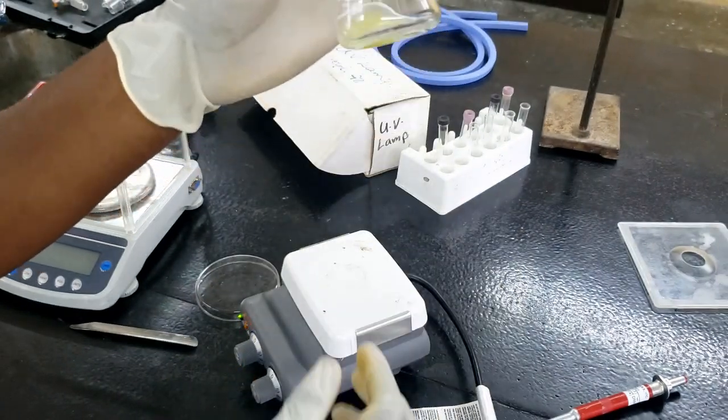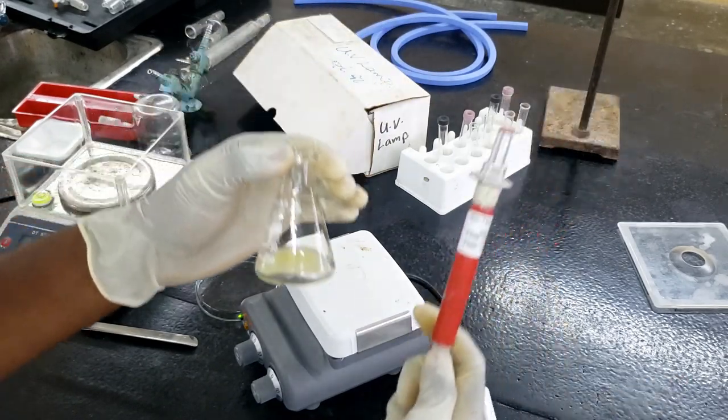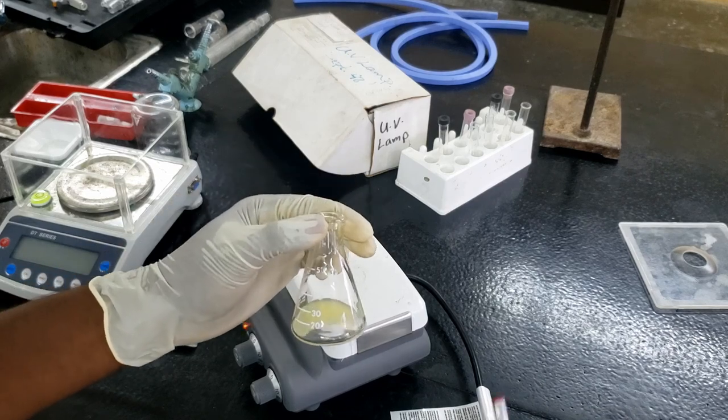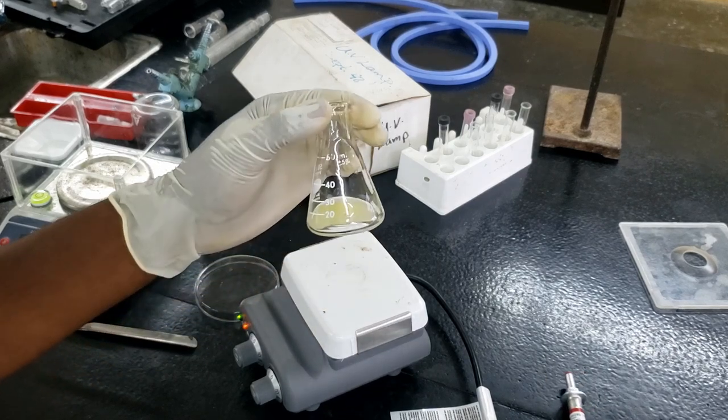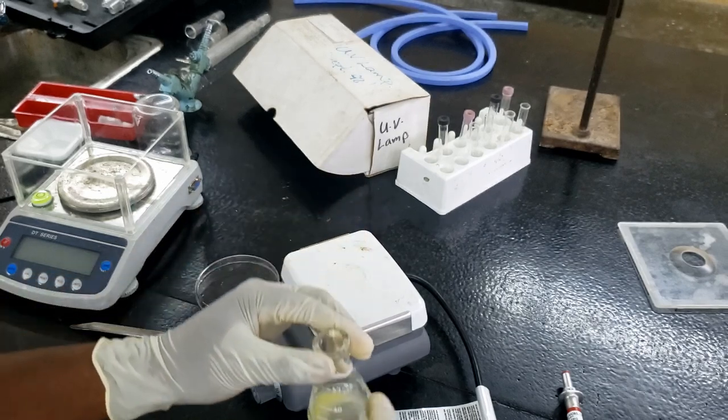So what I'll do now, I'll leave this to cool down to room temperature, and I'm gonna take my micropipette and remove all of that oil, separate it into a small test tube, and then we can move on to do the column chromatography and the TLC.